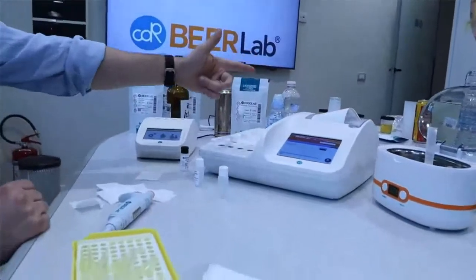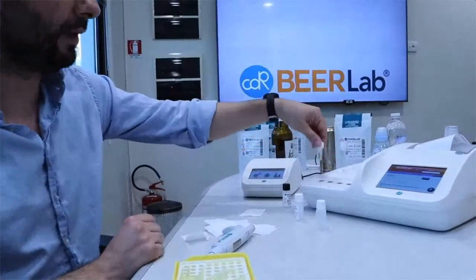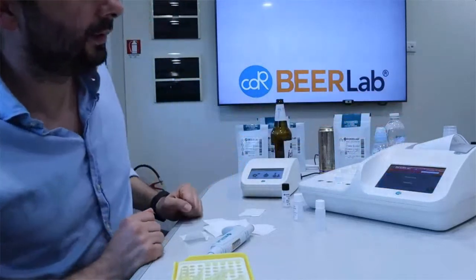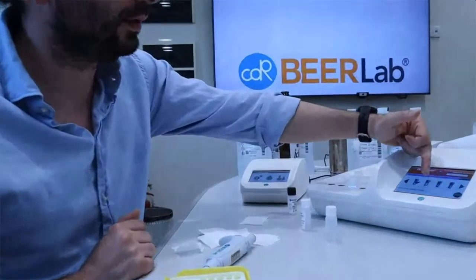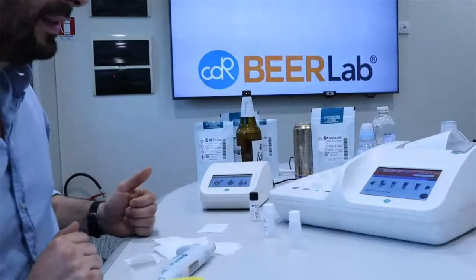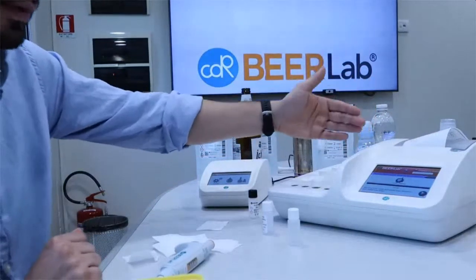And now we have just to insert the test tube into the reading cell. We shake a little bit by inversion before, and we press to do the reading. As you see, you can press on sample 2. So as I told you, we can do a session of analysis. Now we have to do just 1 test, so we press stop. And this is the screen of the second part of the analysis.